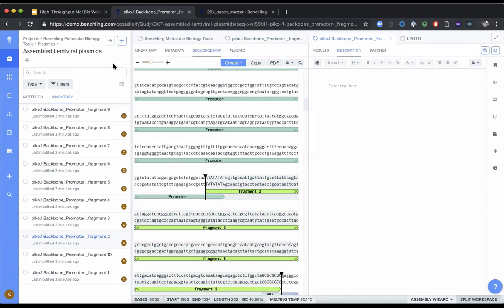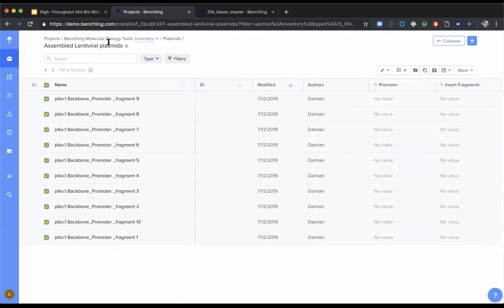So in maybe 6 minutes, I was able to bulk assemble 10 very unique plasmids and automatically set or establish the metadata I need to capture against them and tag the sequence with all of the relevant parts.